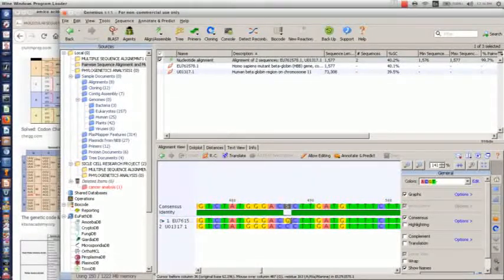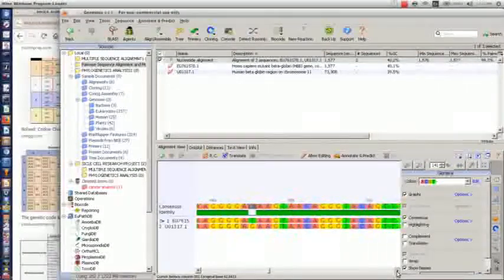So that's it, and then you move on to the next one. Understand the kind of mutation that took place. It is a substitution mutation, but what actually was mutated there was C, replaced with G.